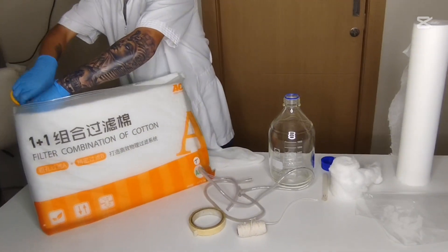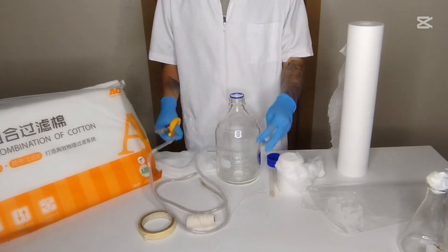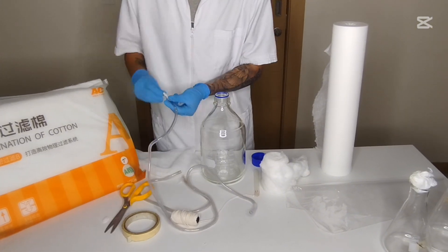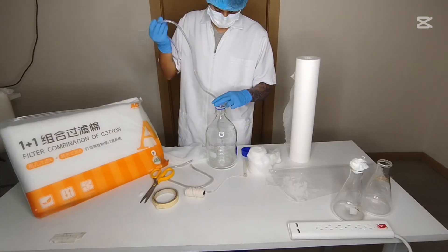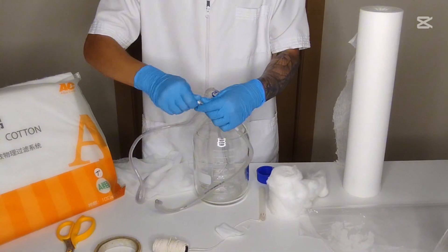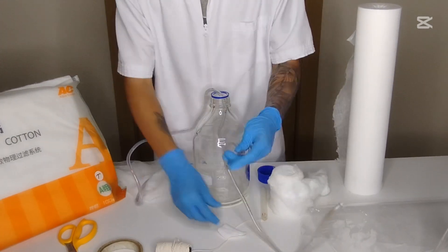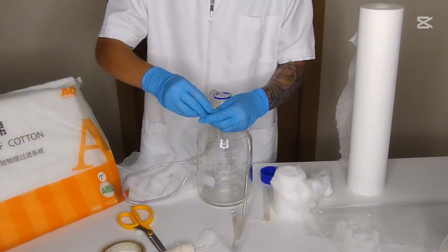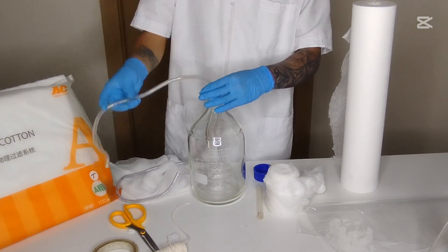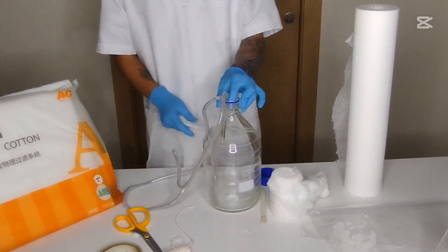Materials needed: a sterile plastic or glass container with a secure lid, e.g., a 5–10L water jug or fermentation jar. For air supply, use an aquarium air pump with a sterile air filter. You'll also need silicone or plastic tubing for air input, and sterile filters rated 0.22–0.45 microns for air sterilization.